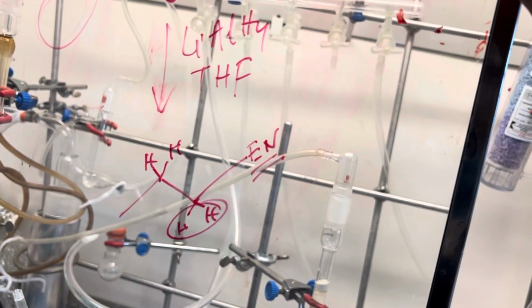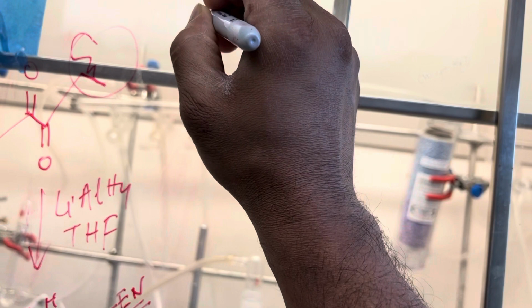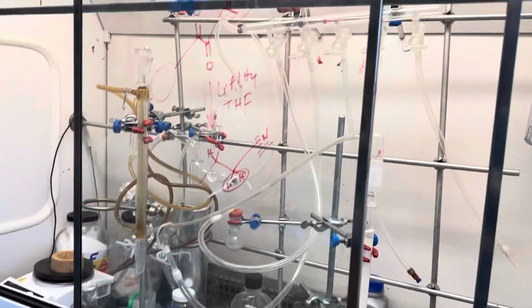Suppose you have a benzyl protecting group in your molecule. Suppose this part is your important part, but it is benzyl protected. Then that CH2 peak especially is the signature peak. You can integrate it, because it will show up in a certain region of the aliphatic area, around 5.2 or 5. So that could be a signature peak, and that will help you realize.